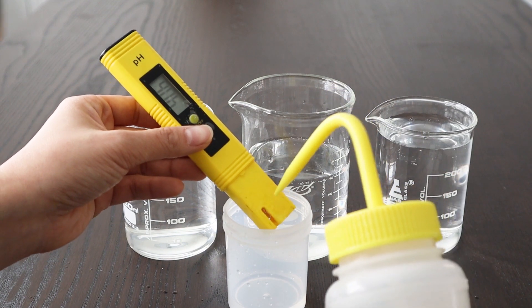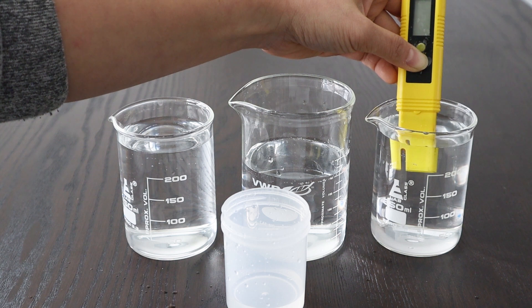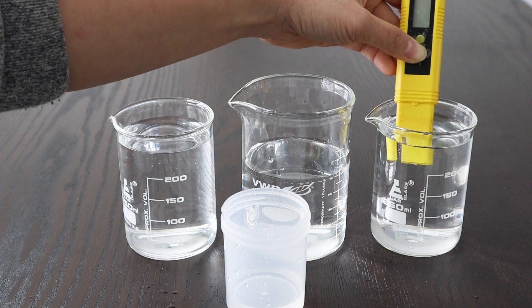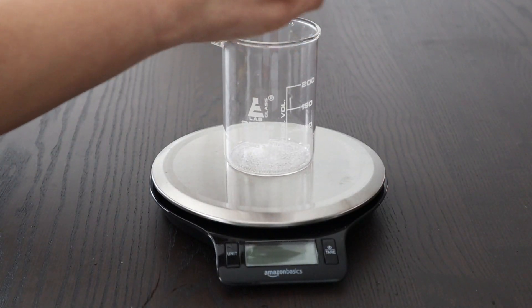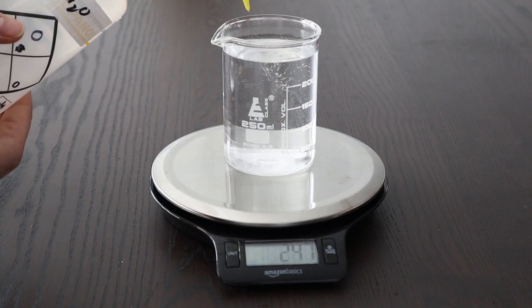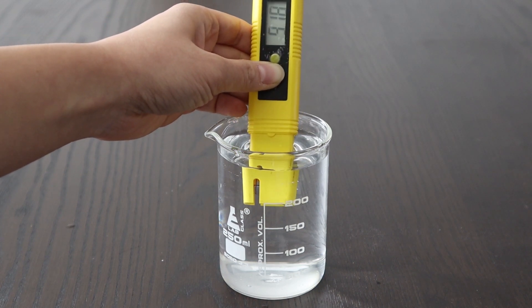I rinse the electrode one more time and put it in the 9.18 solution. I press and hold the calibration button for three to five seconds, then press it once, then one more time to get it to flicker to the 9.18 calibration mode. For my solution, it looks like it's reading an error — I may have made my 9.18 solution incorrectly, so I'm going to try this again. I'm remaking my 9.18 solution by pouring in the powder and then adding 250 ml of distilled water, stirring until dissolved. After rinsing the electrode and testing again, it's putting an error once again.